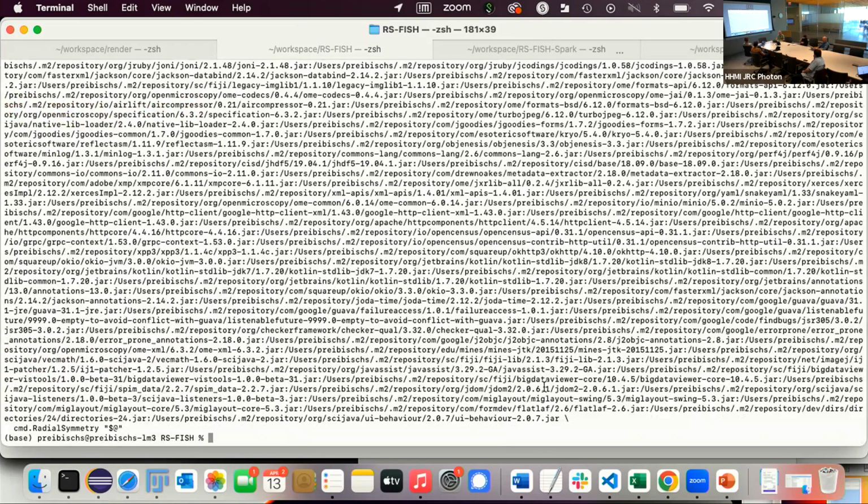And that works very robustly on Mac, on Linux. I haven't really tried it on Windows. I think it should work as well in the subsystem. But the hard part is to have Java installed, otherwise it doesn't work. I think that is the reason why people still started building Docker containers around this, because then you get rid of this aspect of it.